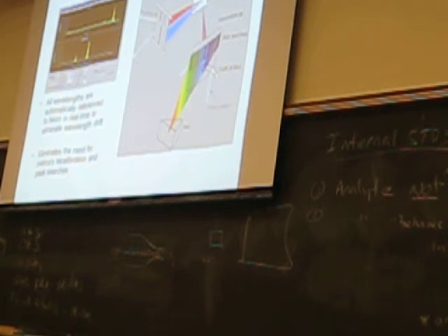So you're going to go in and say, I want to look at iron and zinc and lead and copper and whatever. You tell the software that, and it recommends for copper these 3 emission wavelengths, for lead these 2 emission wavelengths, and for zinc and so on. So he'll select 8 or 10 different emission wavelengths to monitor, plus the wavelengths for scandium and yttrium.